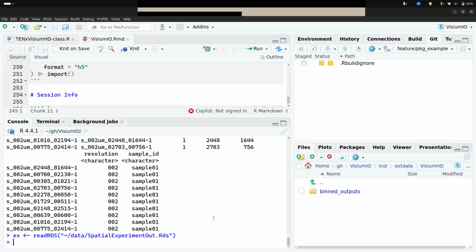Yeah, I think they prioritize flat files. I think the aim is to have a language agnostic file format that works both in R and Python. So yeah, might be. For things like this, you can write your own export method so that it saves it as a JSON, for example.